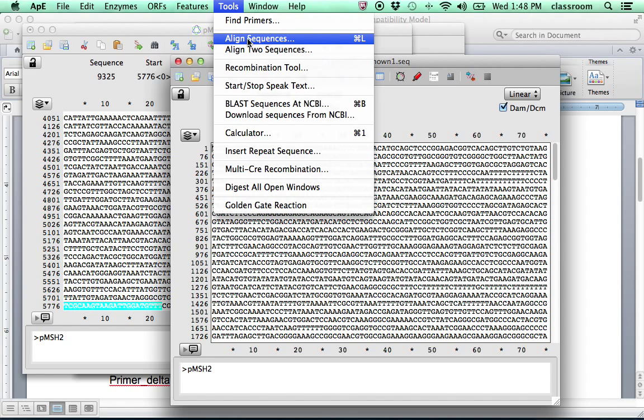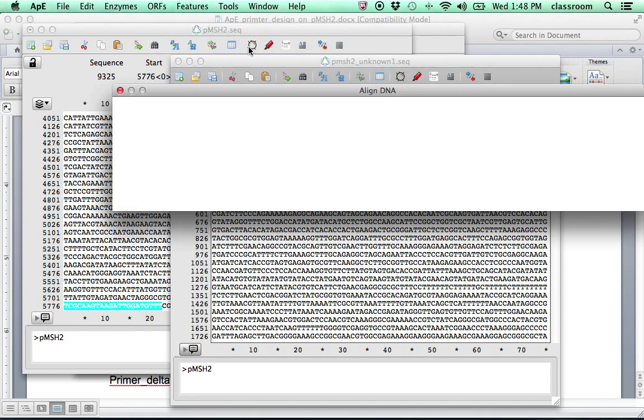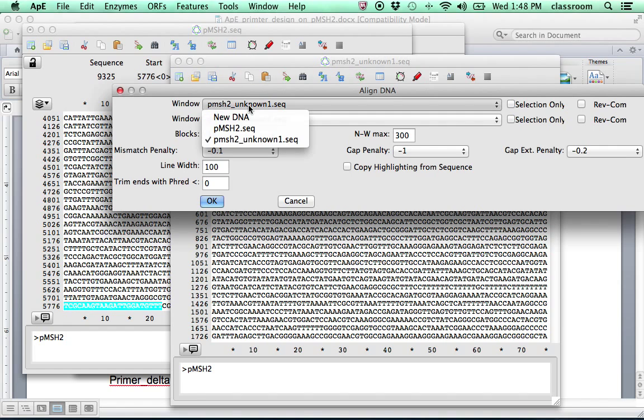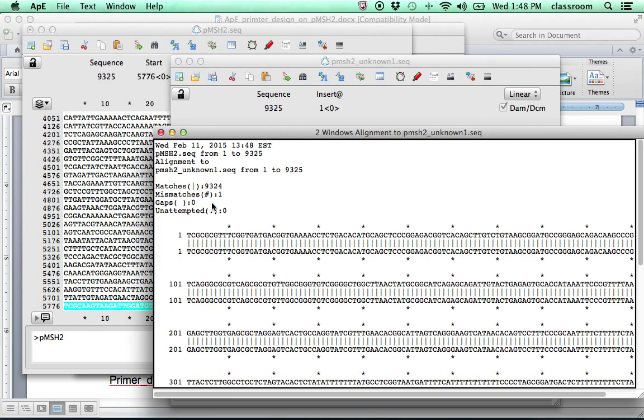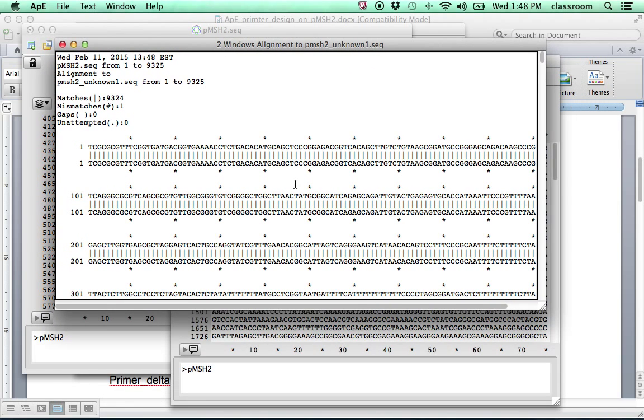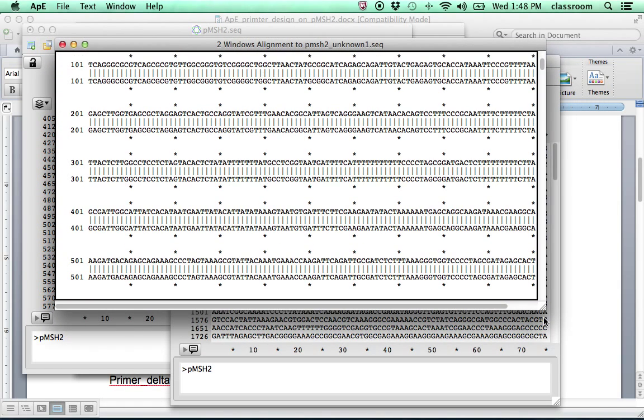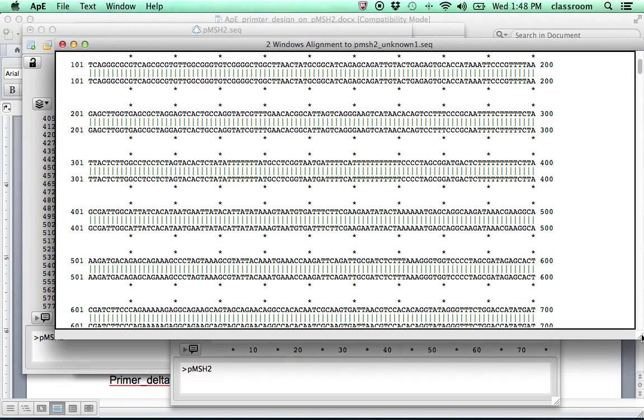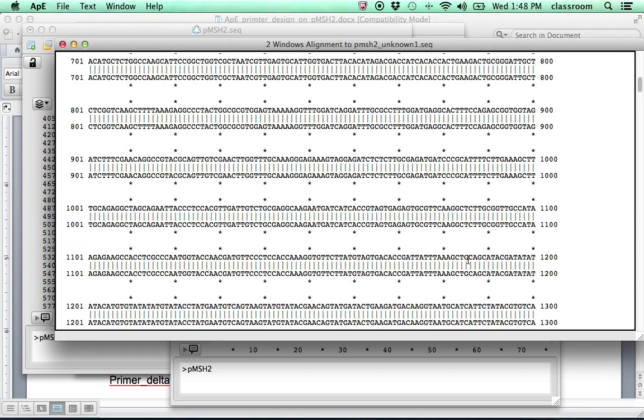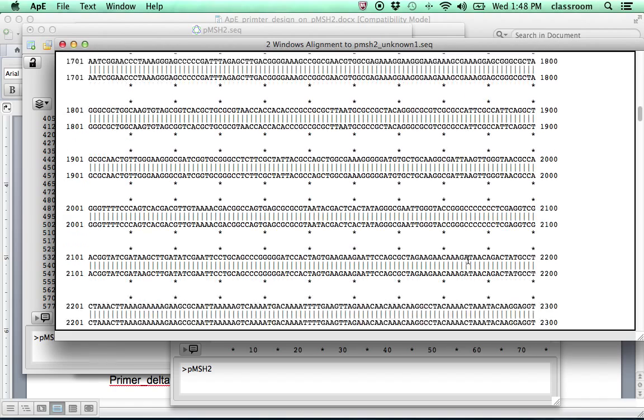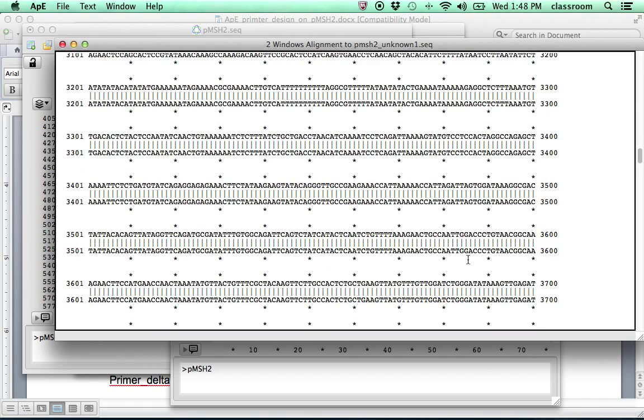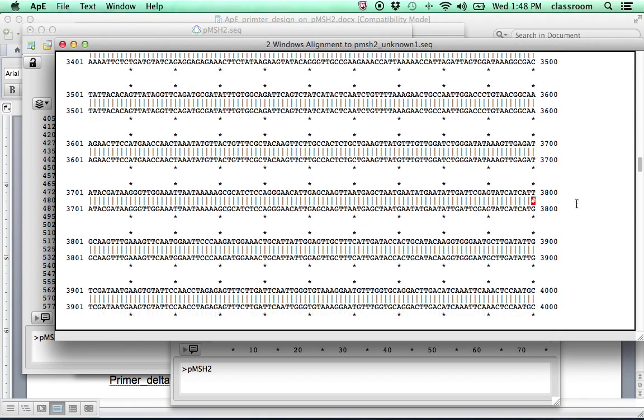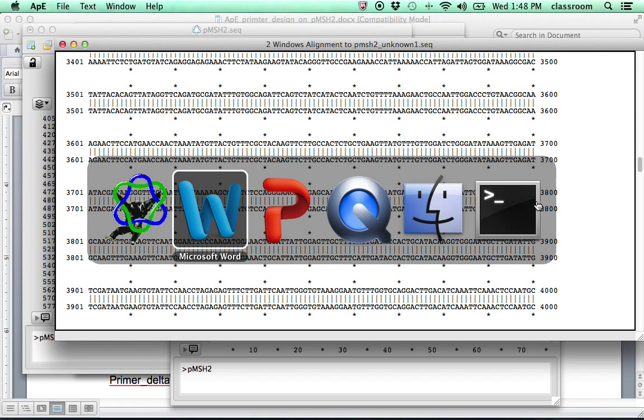And we just need to first find out where the mutation is. Go to Tools. Align the two sequences. I'm going to pick the wild type at the top, mutant at the bottom. Scroll down. There. You will see the mutation in the region 3800.